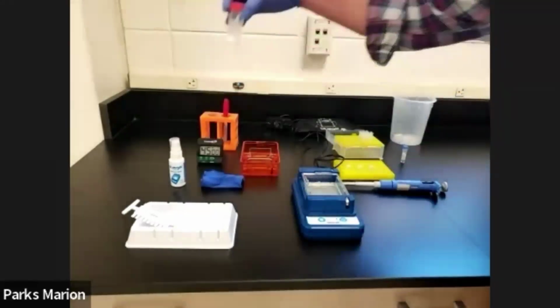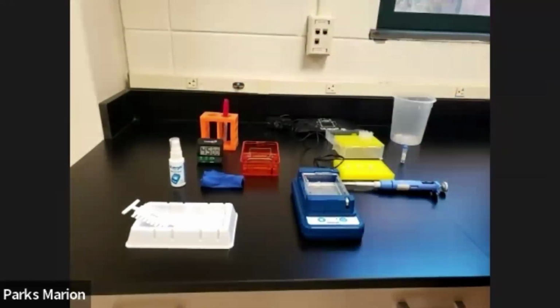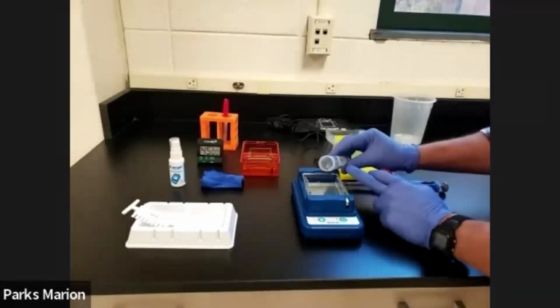Now we're going to obtain our conical tube, which has 30 milliliters of TBE buffer solution. And we're going to gently pour the buffer solution over the surface of the gel that's in the buffer chamber. This buffer should just cover up the gel and the wells, and we should make sure that there's no air bubbles in those wells. So gently pouring over top, like so.